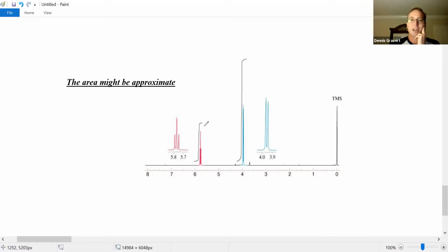Okay, so what have we got? We got no numbers reported. That's too bad. We have to estimate it. So if you look at where it starts to where it ends, that's how many hydrogens. Let's just say it's 1. 1 hydrogen is producing this peak. And now we eyeball it over here. And then you just eyeball it. And I think that's a little short.